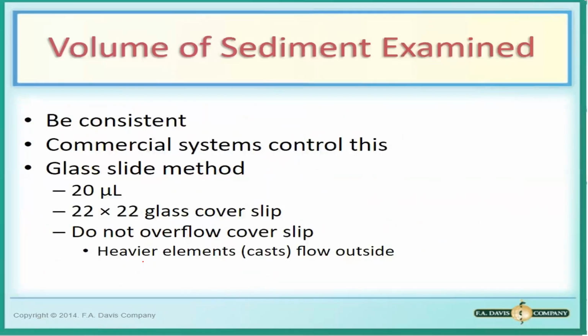Sorry, mali. Yung 0.5 to 1 ml, that is after the decantation. Pagka-decant mo, yung may iwan sa tube is roughly 0.5 to 1 ml. Sorry. Ang ilalagay po pala sa glass slide is the 20 µL, using a 22 by 22 cover slip.